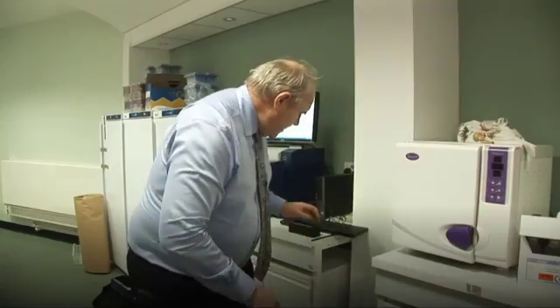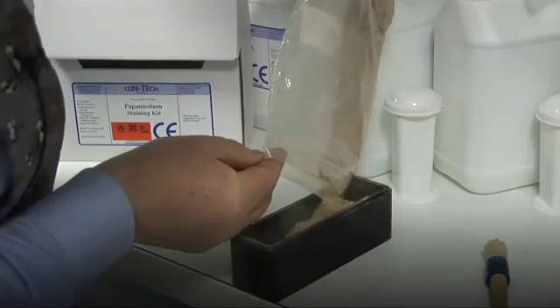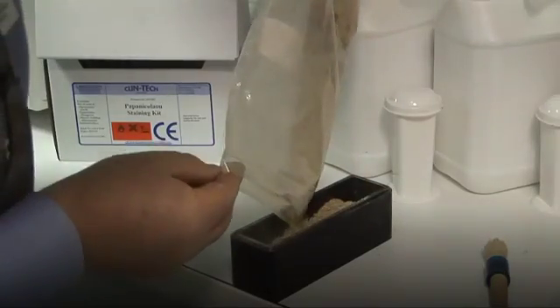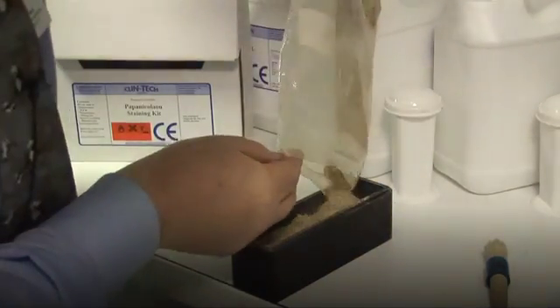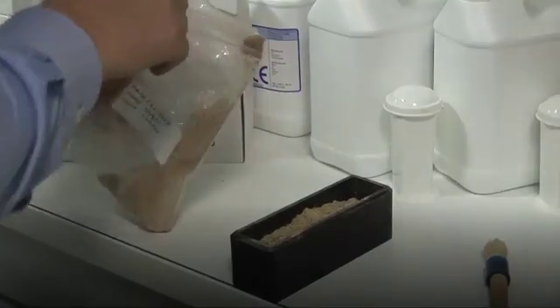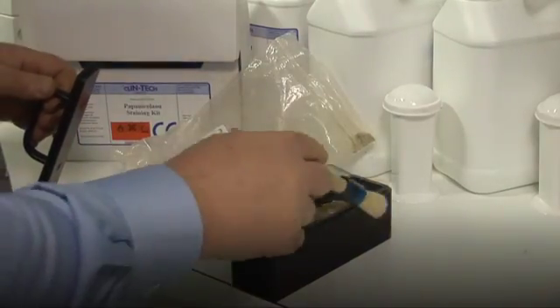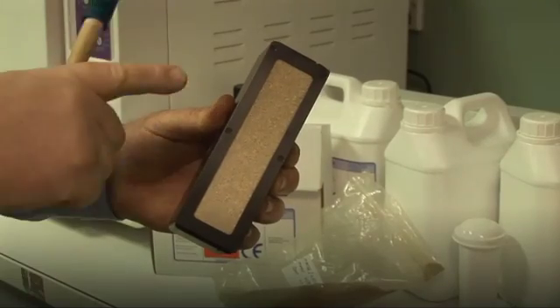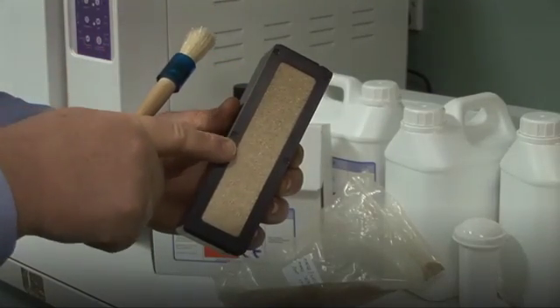Just behind me here we have a cell which is full of a sample. This happens to be a mixture of maize and lucerne, which has been freeze-dried to remove the water from it and keep it in a stable condition. It's then been ground through a grinder which has a one millimetre sieve, and you can actually see on the bottom of the cell that there is a glass window through which the infrared beam of light is going to be passed.